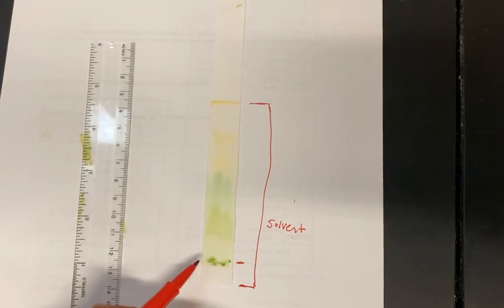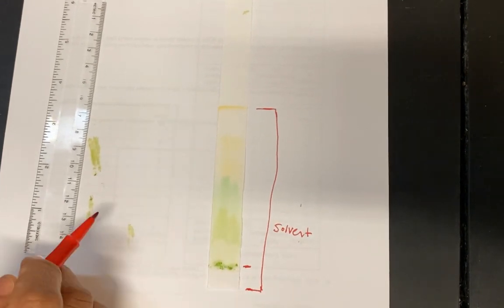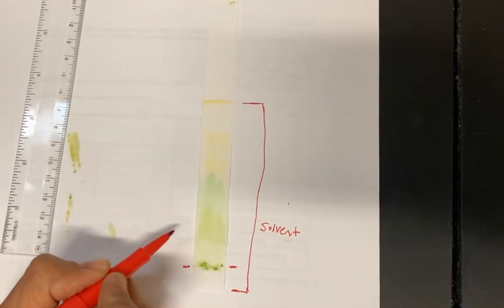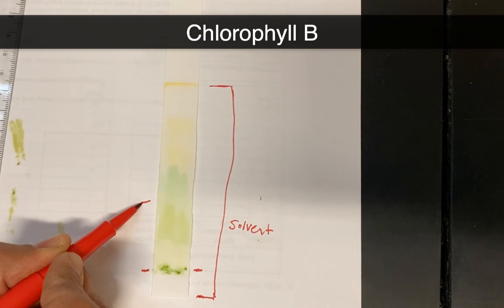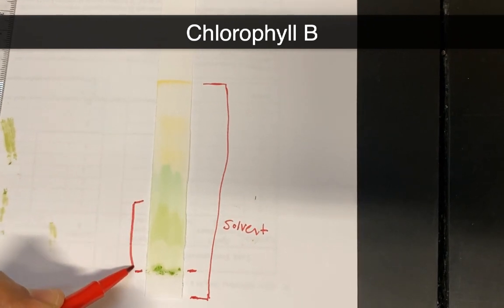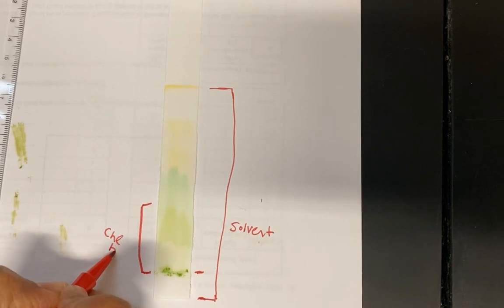And then the mixture separated by how polar or nonpolar it is, and they went to their specific places. So the first one, which is this kind of yellowish green, is chlorophyll B. Okay, so it went from here, and I'm just going to go to the peak, which is right there. So it went here. That's the blue-green one.